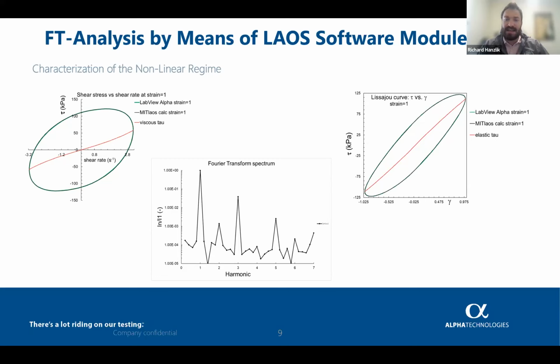And this test is kind of SSW, or more in general, an MX test, subtest, or matrix subtest. Essentially what we're doing is applying a very large strain, typically 500% strain, 1000% strain, 1200% strain in some cases. And we're using a software module that records the first non-even higher harmonics of the torque signal, and then evaluating those differences in signal against one another.